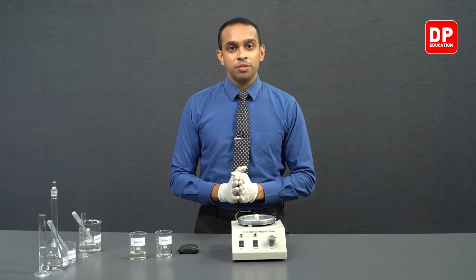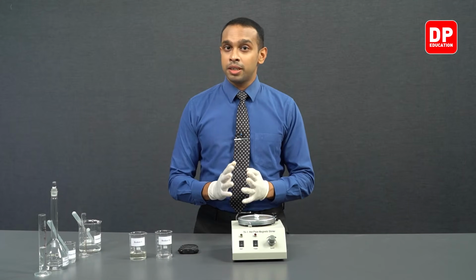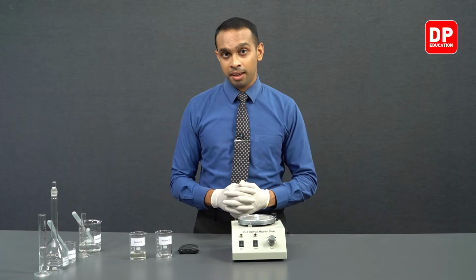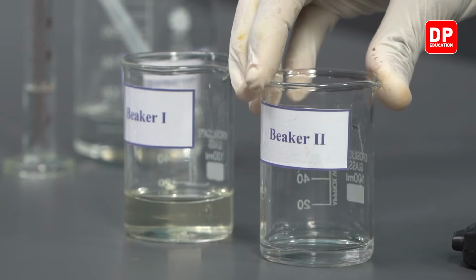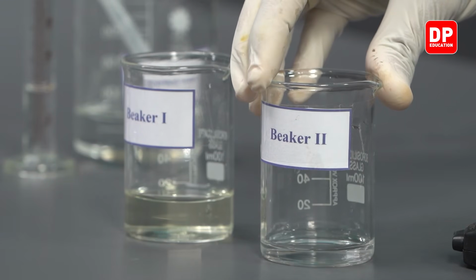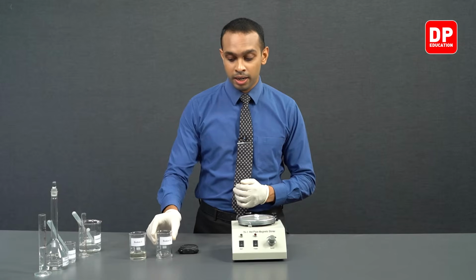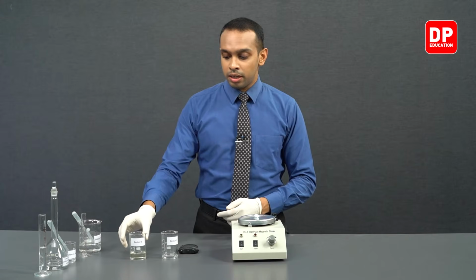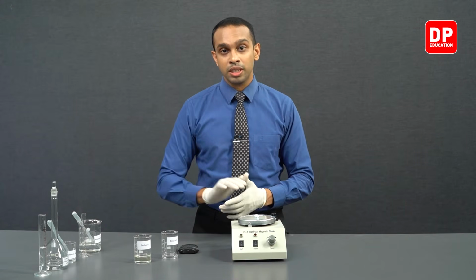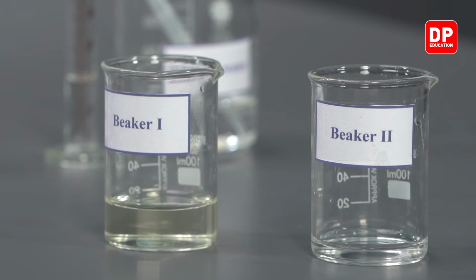Now students, we move on to the second reaction in part B. In this reaction, we have decreased the iodide ion concentration yet again by taking only 6 cubic centimeters of iodide ion solution we prepared earlier. So we have only 6 cubic centimeters of iodide ions taken into this beaker 2, as you can see. And then in beaker 1, we have 25 cubic centimeters of acidified Fe3 plus ion solution with a concentration of 0.1 moles per decimeter cube.